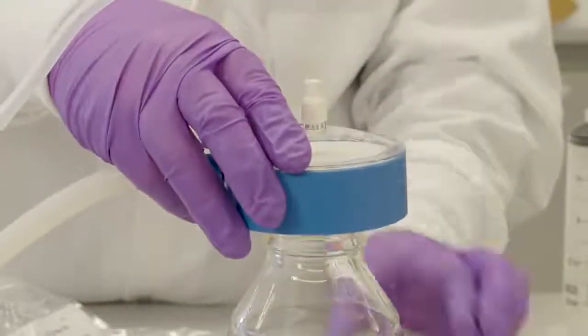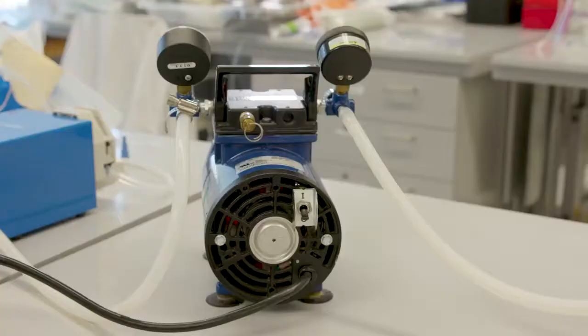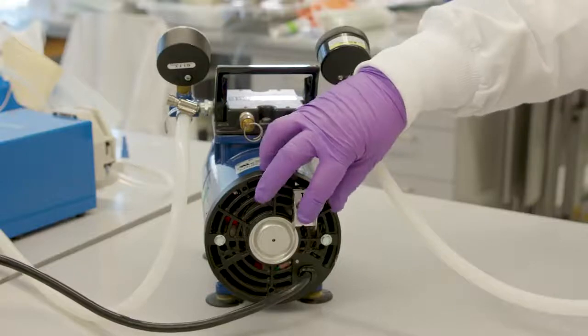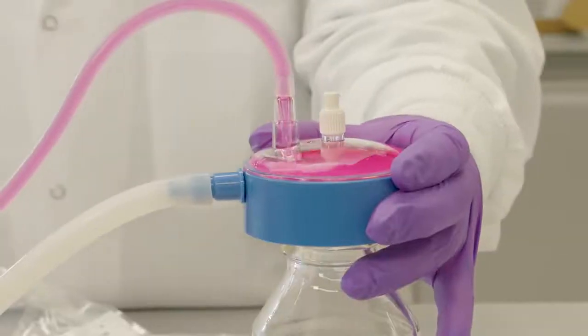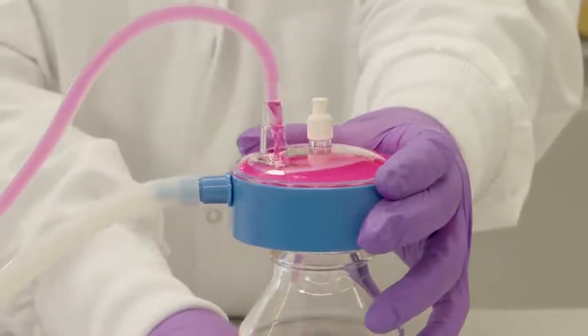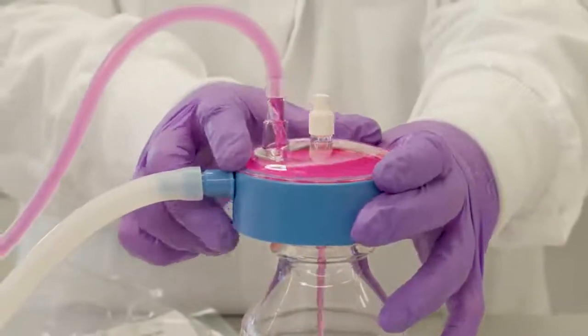Hold the SteriCap Plus onto the top of the receiver bottle and turn on the vacuum to begin filtration. Continue holding the unit until the vacuum source secures the filter unit into place and the flow starts into the receiver bottle.